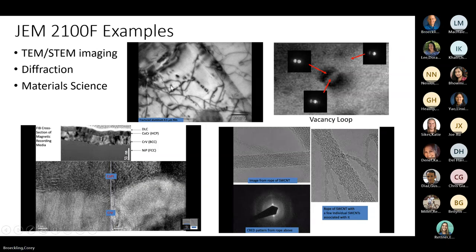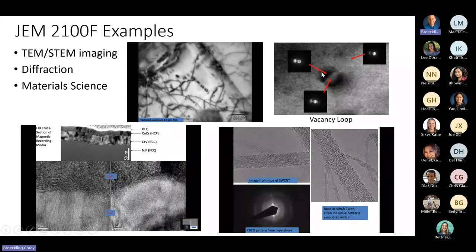For those of you who have no idea what those lines are, those are what's called dislocations. Here's a high mag of one of those loops. We actually did convergent beam in the loop area to show the difference in orientation outside and inside. So these are things you can do with TEM.